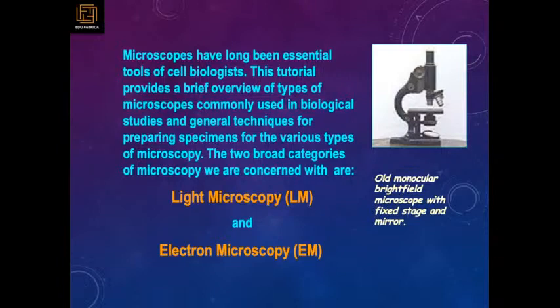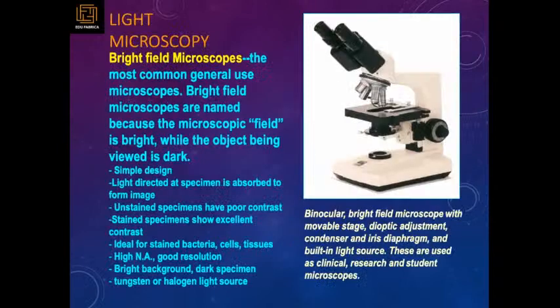So microscopy has been a very essential tool for cell biologists. This PPT will basically show you how you can prepare your biological studies, general techniques, and how you can use light microscopy and electron microscopy in order to see the world of cellular biology.